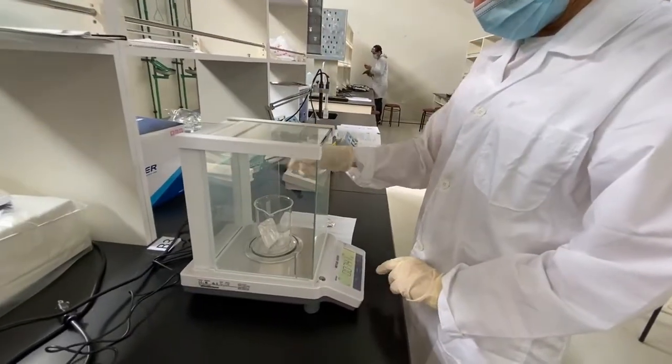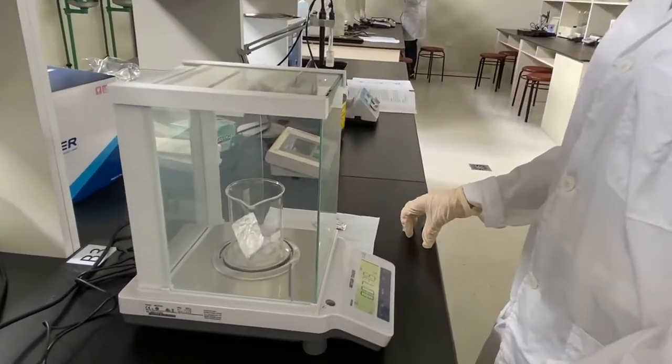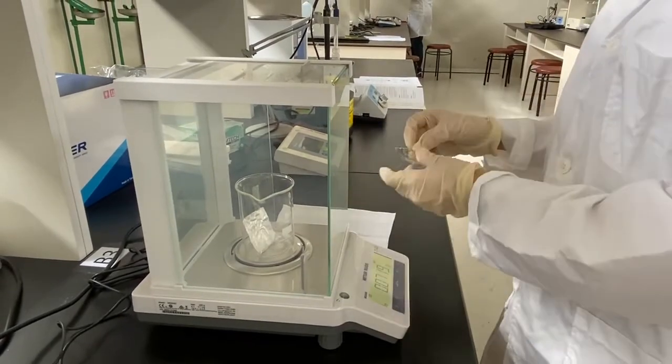For that, it is necessary to know all instrumentation and other specialized apparatus that the students will use in scheduled laboratory work.